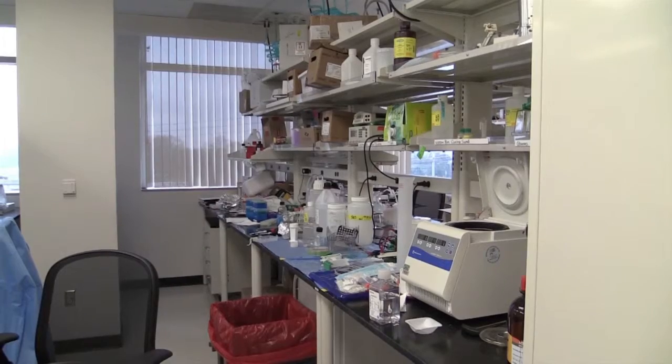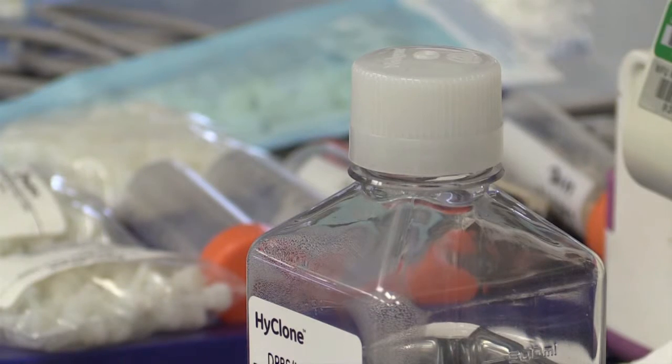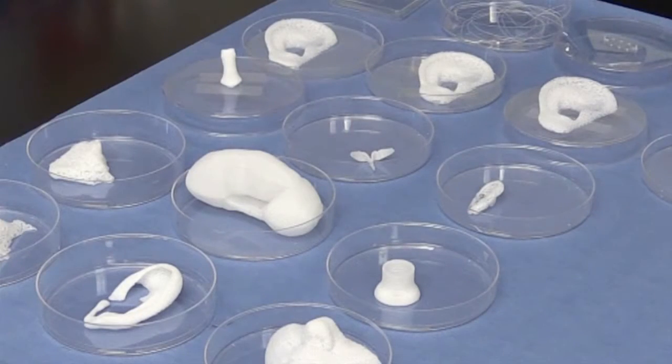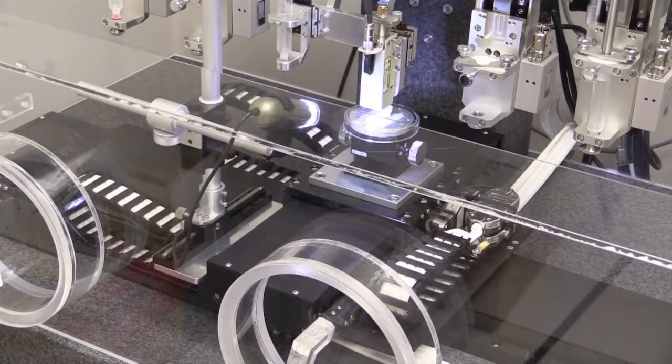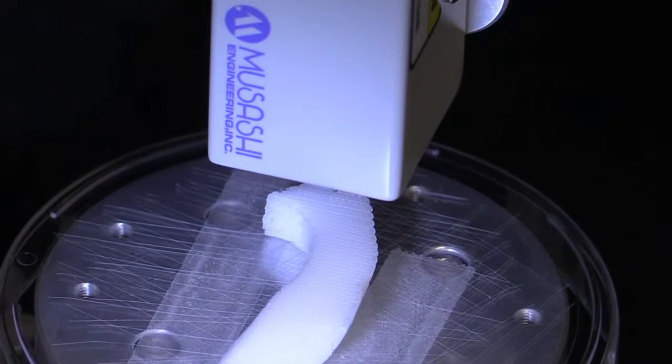Instead of using ink, the printer spits out a special gel mixture consisting of cells and nutrients. The printed dots slowly dry to harden. You need very small nozzles, down to 1/80th the diameter of a hair. One advancement with these printed structures are tiny channels that let oxygen reach the inner cells, in a way creating a highway, allowing the nutrition to get to the tissue itself.